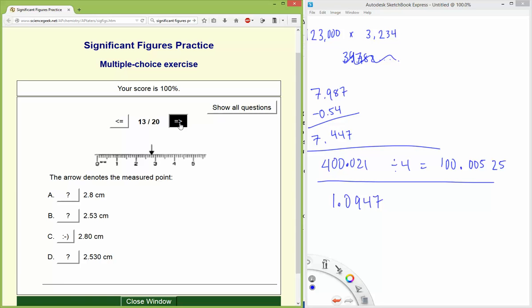And that's not to say it's an inaccurate scale. It's just doing the best it can. Well, yeah, it's the final decimal, and I guess it depends from scale manufacturer to scale manufacturer how they handle that, but that's how we go.